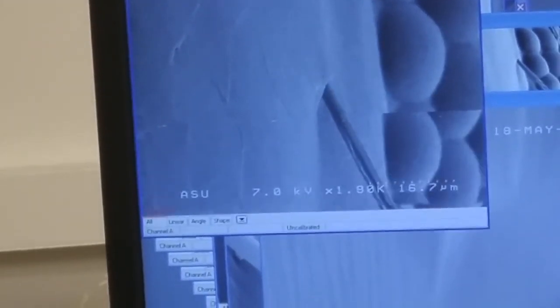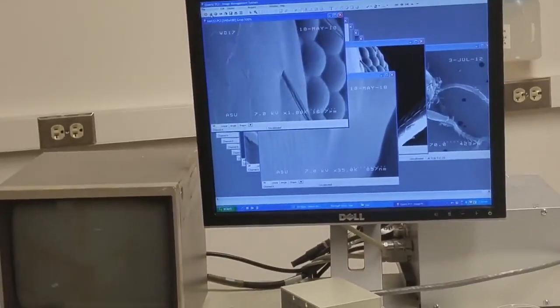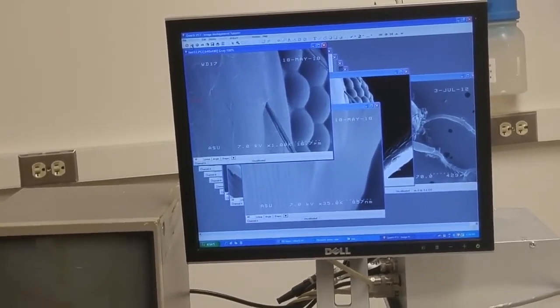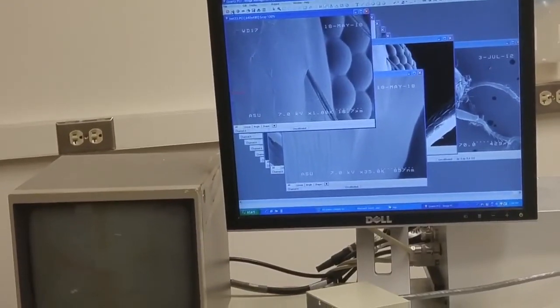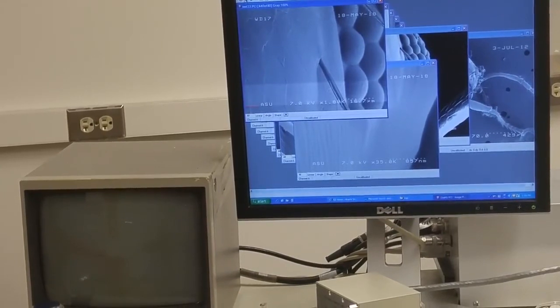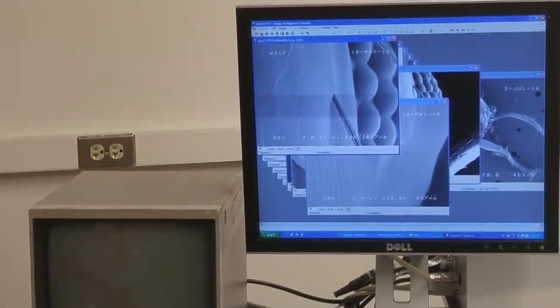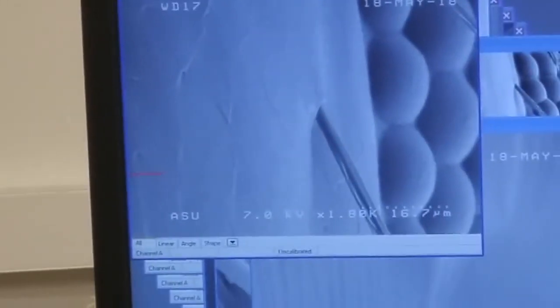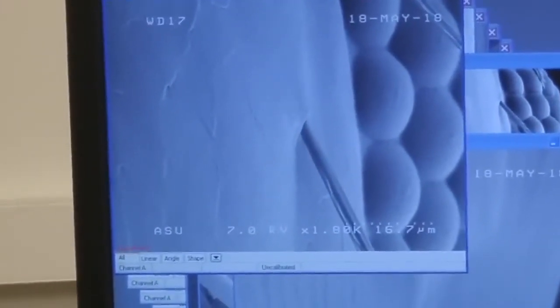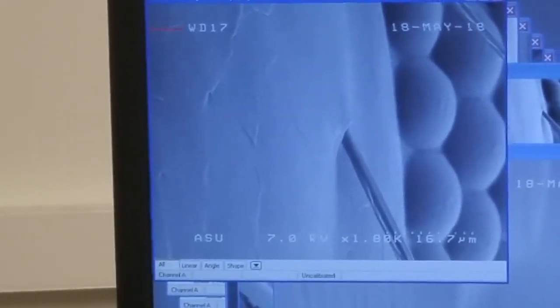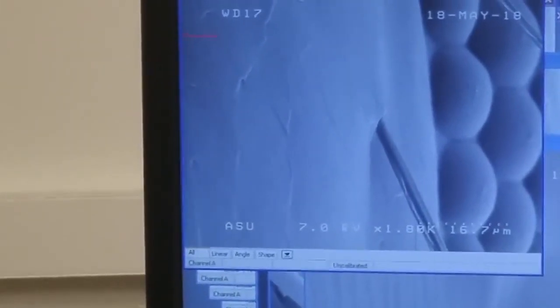So we know where the data comes from — that's the eyes. Slow the scan. Let me adjust contrast and brightness. Okay, that looks fine. Slow scale 4, better quality. And then after this frame it's going to be stopped.